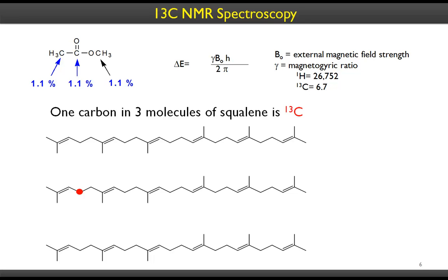Okay. The other factor that is causing this kind of insensitivity is the gyromagnetic ratio or magnetogyric ratio. The gyromagnetic ratio of C13 is only about 1/4 of that of hydrogen. So it's 4 times less sensitive compared to hydrogen. In other words, hydrogen is a bigger magnet, so it would produce a bigger magnetic field compared to carbon-13 nuclei. Proton would be a bigger magnet. Okay, so the magnetic field that is generated by the nuclei is very small here.